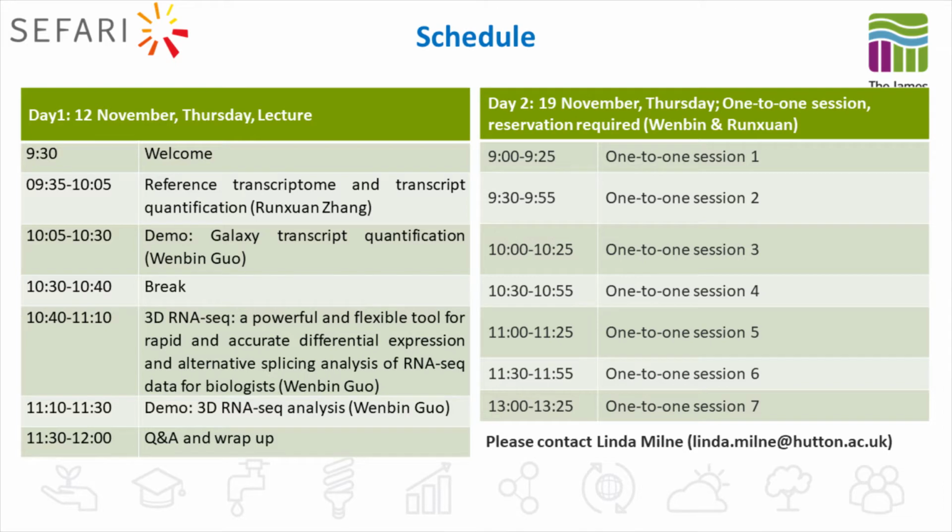So the rough schedule for today: we will have a welcome. For the first part of this training, I will give a presentation regarding the transcript quantification part. After that, Wenbin will give us a demo to show you how to do that on the EU Galaxy, which is a free server you can use. Then we will have a break, and then another talk. Wenbin will present the details of 3D-RNA-seq, followed by another demo by Wenbin, using an example data set to show how that works in real time. And finally, we'll have Q&As and a wrap up.